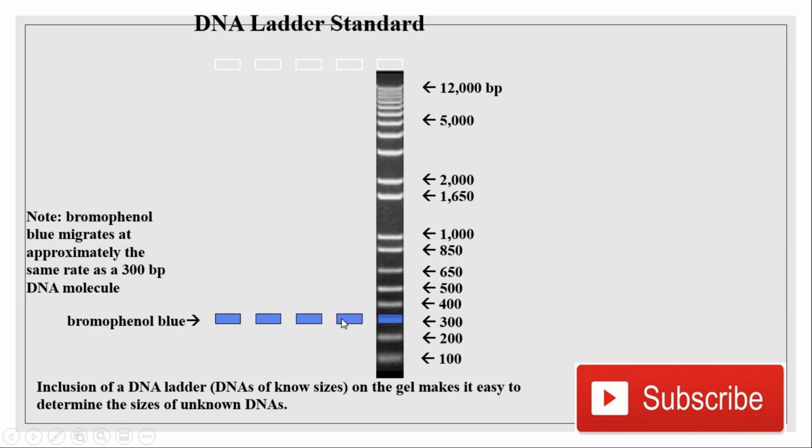In most cases DNA has the higher size, so it will appear in this range, and the PCR product will appear in the 400 and 500 base pair range. So it depends upon the primer that you select specifically for your organism or species that you are using to identify.